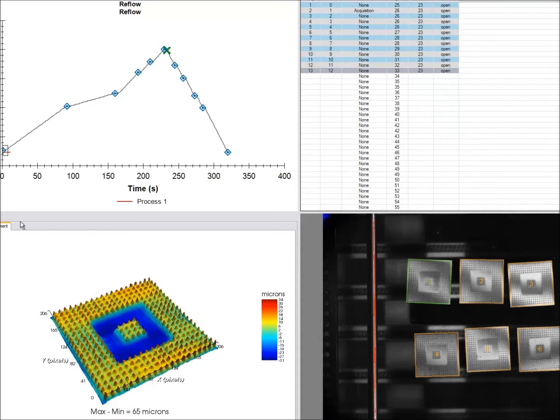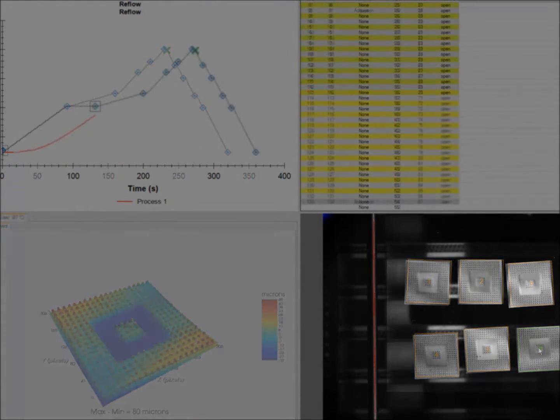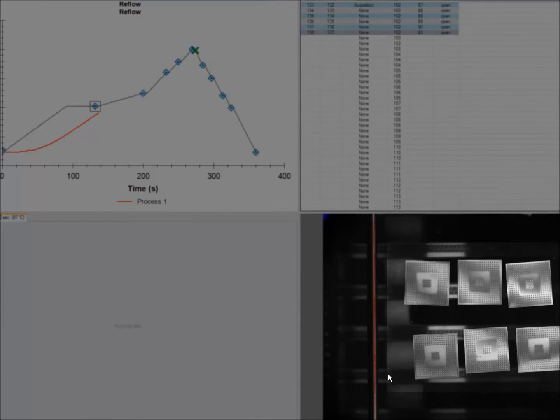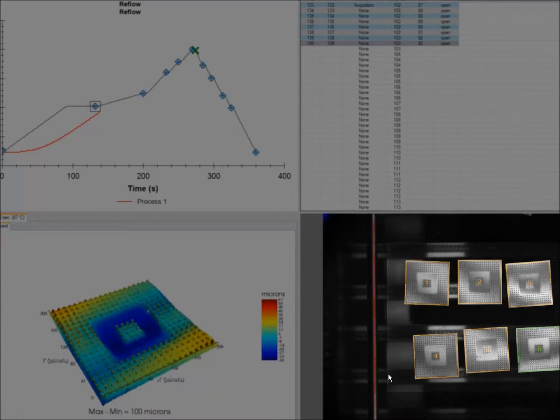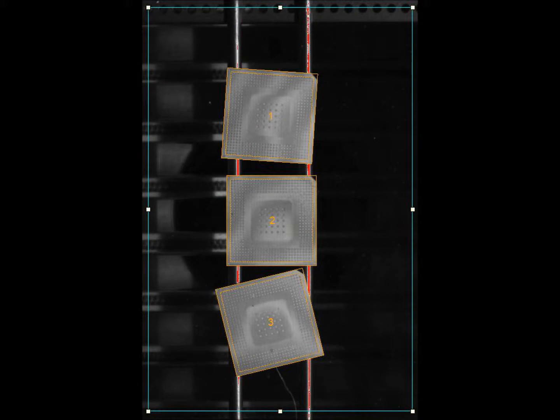Akrometrix customers are often trying to correlate data between different equipment, locations, and companies. The biggest variation in these data sets comes from differences in the area that is cropped. Now, different users and companies can all be cropping the same data set automatically with part tracking. Part tracking improvements to reproducibility, setup time, and system throughput will likely change many companies' approach to thermal surface characterization as well as increase the value of studio-capable equipment.